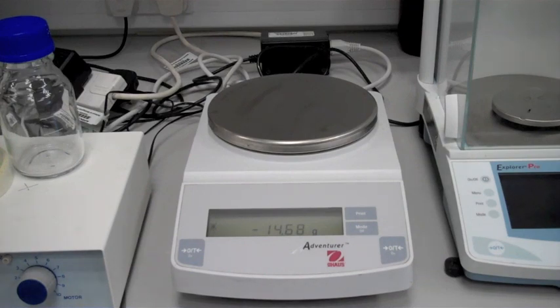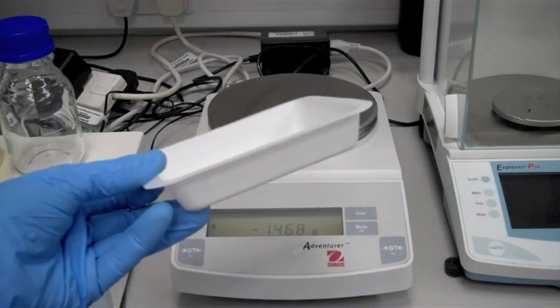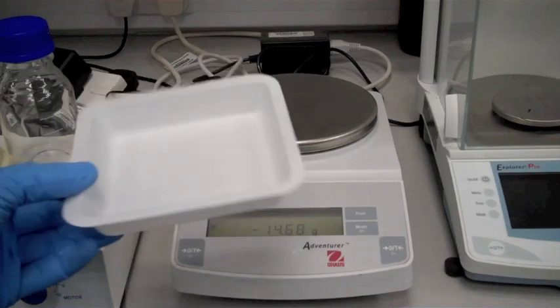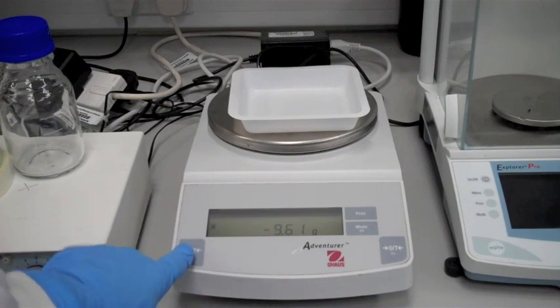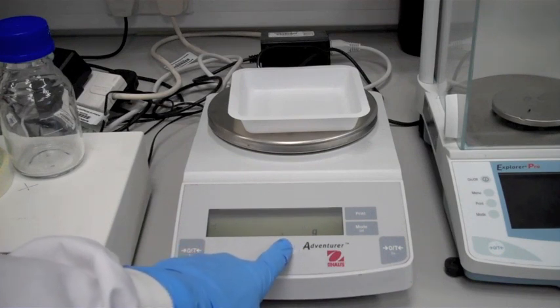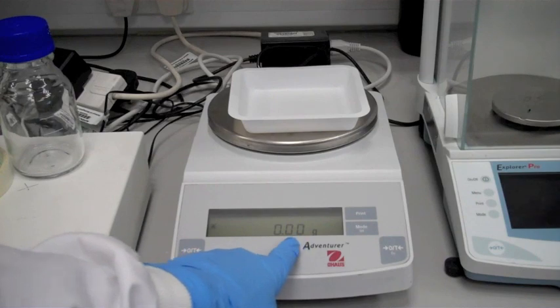Okay, to weigh out, what you need to do is take a clean weighing boat and place it on the scales. Then press the tar button, which is the one down on the bottom there. This should set the reading to zero. See there? Zero, zero, zero.